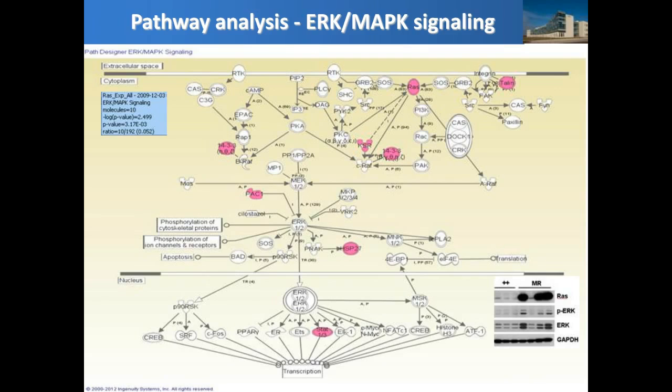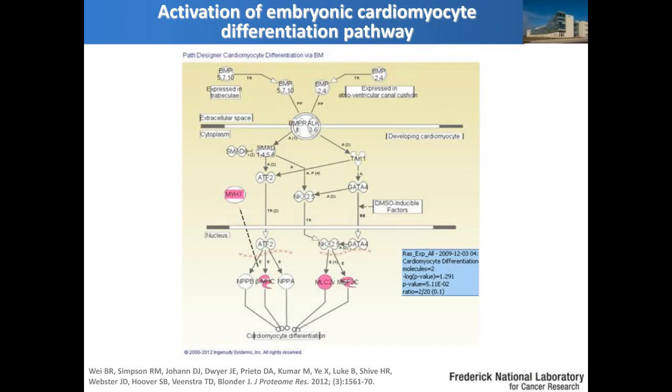We do believe that every proteomic analysis has to be cross-validated, and we have also seen that the phosphorylated ERK is also upregulated when HRAS is constitutively signaling. The other important thing is that HRAS signaling is basically forcing myocytes to produce embryonic myosins, and we have shown those two myosins in Westerns, which shouldn't be present in a heart after birth, because the heart exits the dividing cycle after the birth of any mammal.